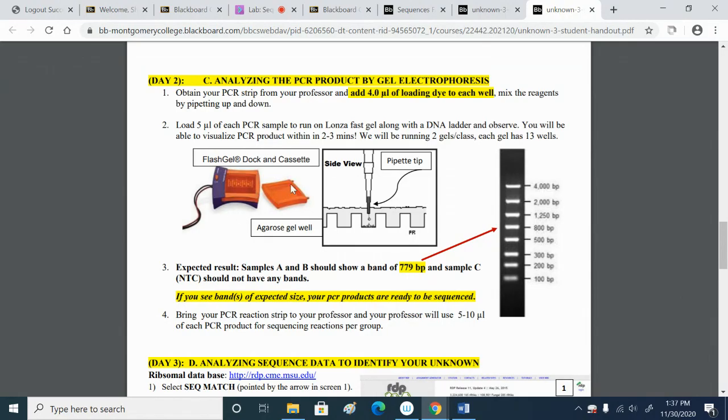And so the agarose gel is encased in a plastic cartridge. And the buffer is included in the gel. So the wells are basically dry wells. So it's not like this diagram shows. There's no buffer floating on top of it. The buffer is incorporated into the gel. And the plastic cartridge, the plastic case, has little holes in it where the wells are.